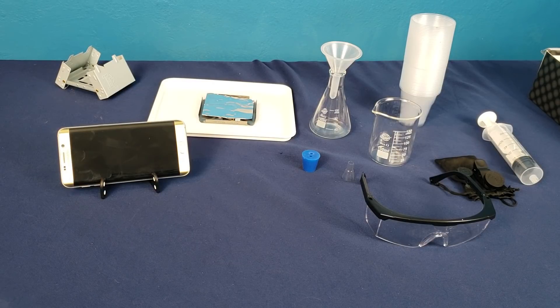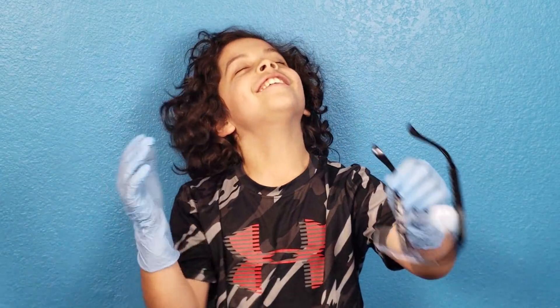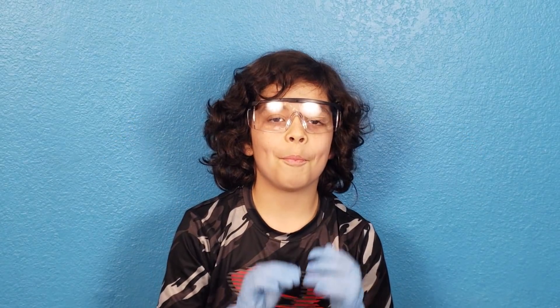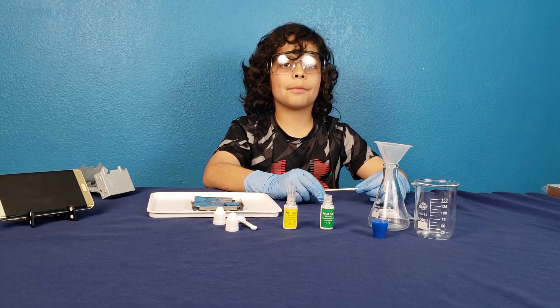It has everything you need to conduct all these experiments. The experiment we chose to do is the carbon snake. Now the most important thing — safety first! Okay boys and girls, it's time for science.